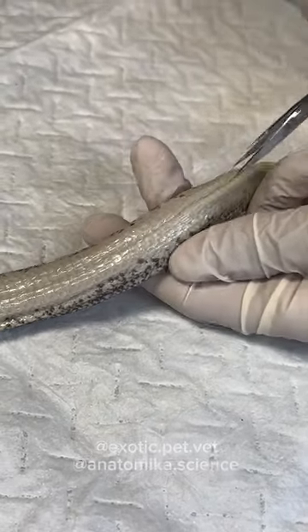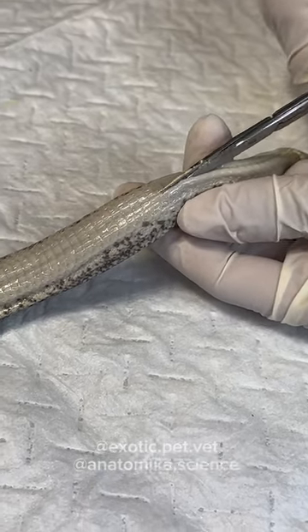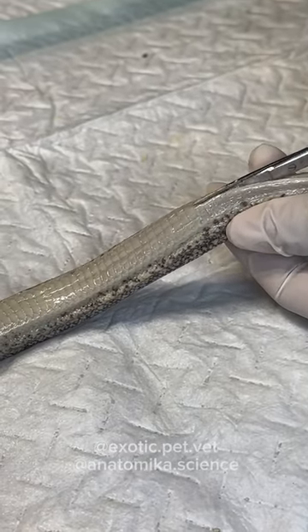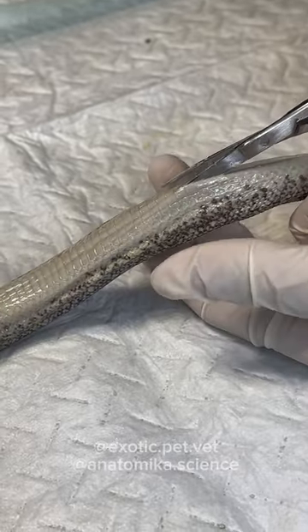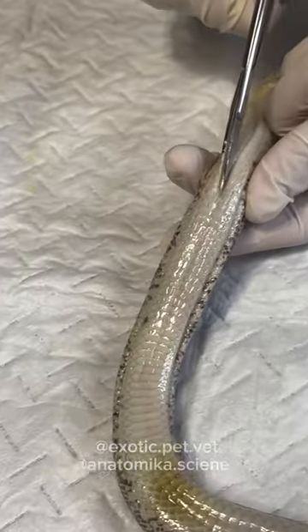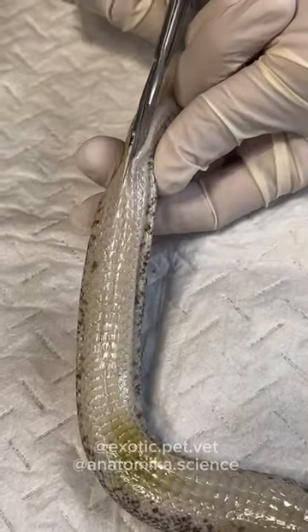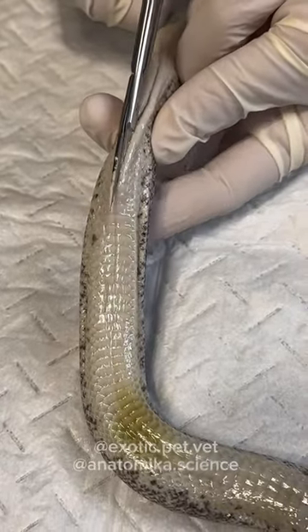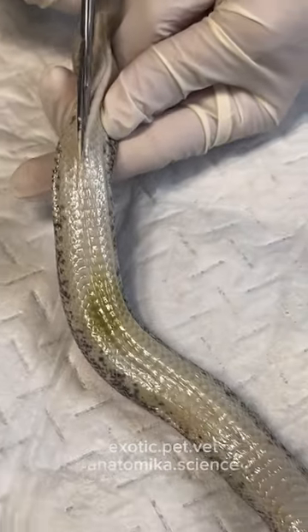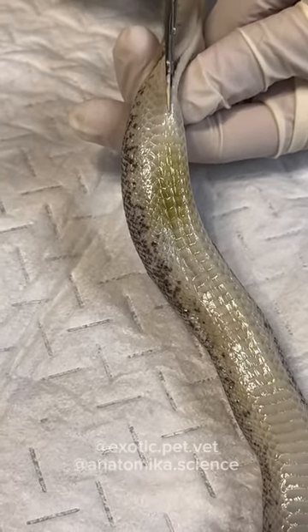On the belly scale, you just want to make sure at all times that you're in the middle of the belly scale — don't deviate. I'm using my other hand to hold the snake and pull it down, then lift the skin up. We do the same thing when cutting into any animal's abdomen for surgery — you always lift up on the belly when making your incision, because you don't want to stab any of the organs.